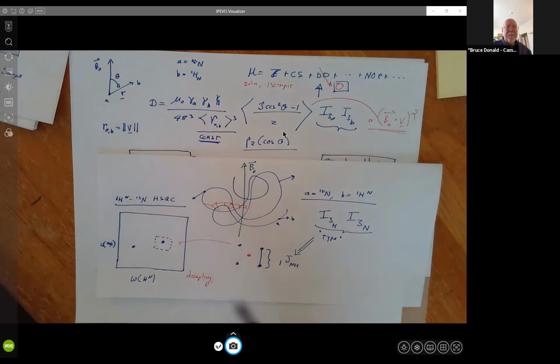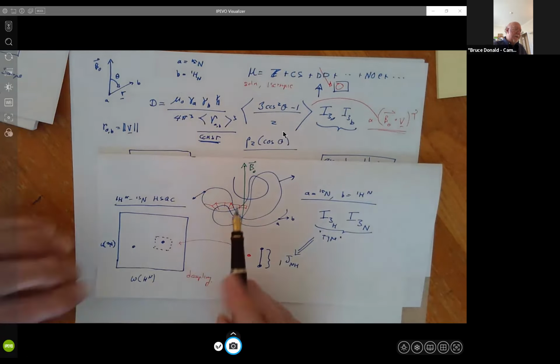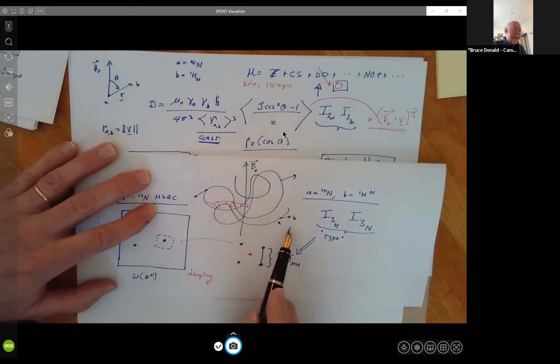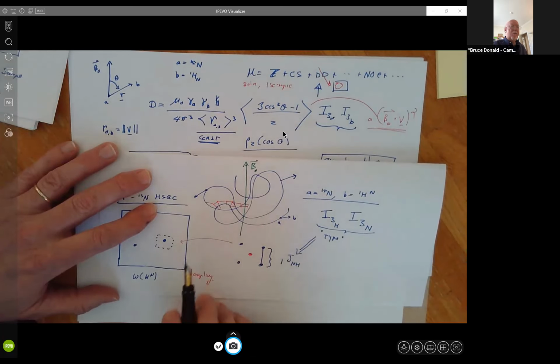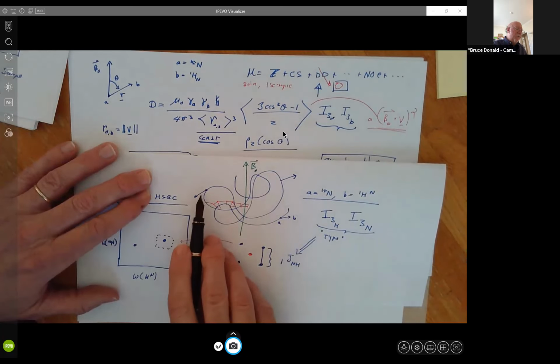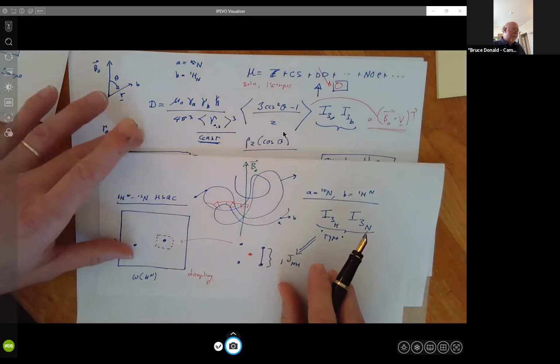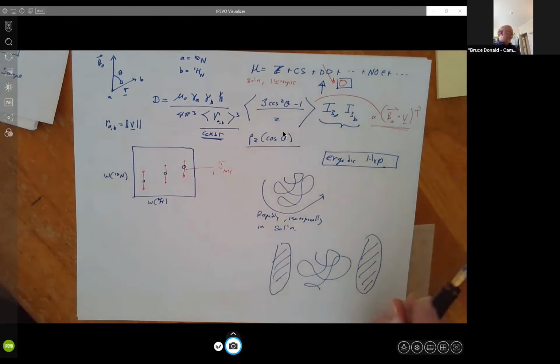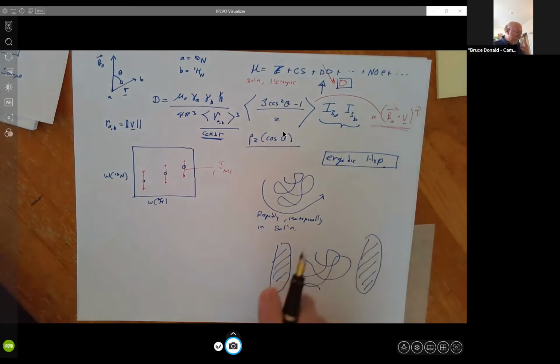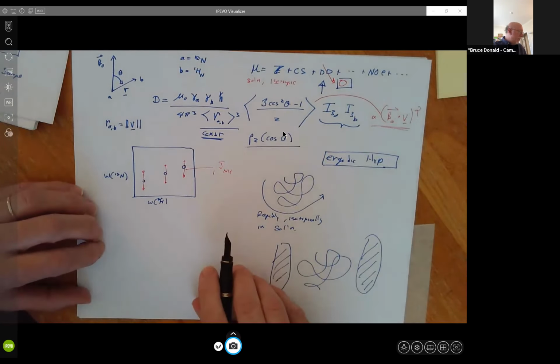Even if this was a megadalton protein, which you wouldn't have, but you might have a complex, if you had a very large protein, and these things are tens of angstroms apart, they're still globally referenced, i.e. you can look at the dot product of V1 and B0, V2 and B0, and then you know something about the relative orientation of V1 and V2 because they're in a global coordinate frame. So this is very exciting because all of a sudden our quality of structures and our ability to globally reference goes way up. But this is still a daunting equation.